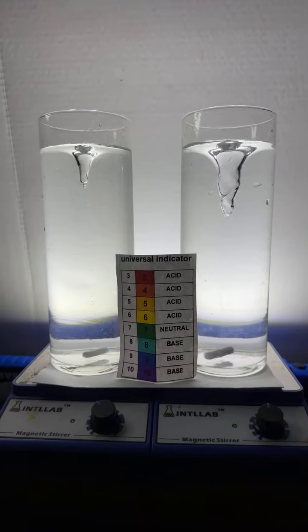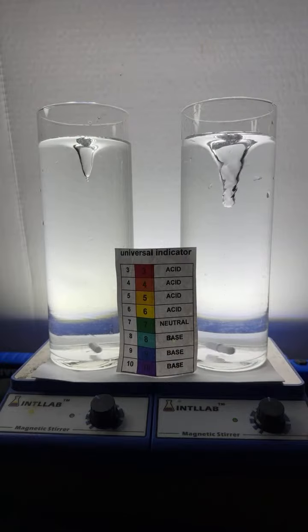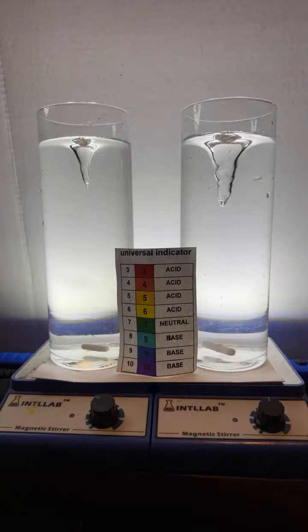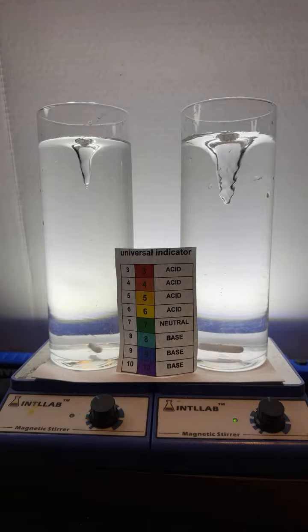And now I'm going to start adding a little bit of universal indicator to each flask. Universal indicator is also known as rainbow indicator. Now let's turn this on so we can see a little better. Right here, these are the different colors that the universal indicator will display at different pH values. pH just tells you how acidic or basic something is.